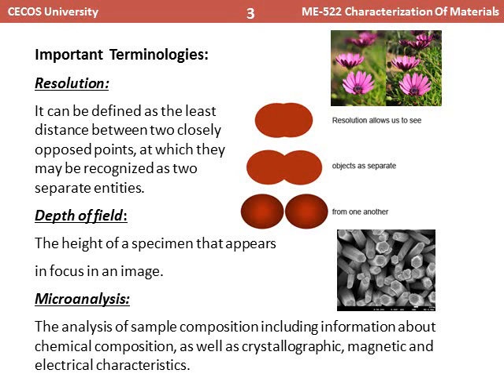But the interesting feature of SEM is that you can visualize the depth of some object, but the depth is not the true depth, because in principle, SEM as a tool, we cannot see the object height, we can only see the object surface.